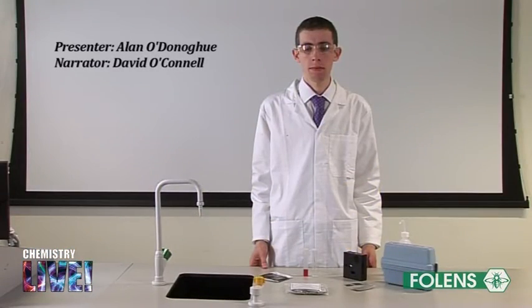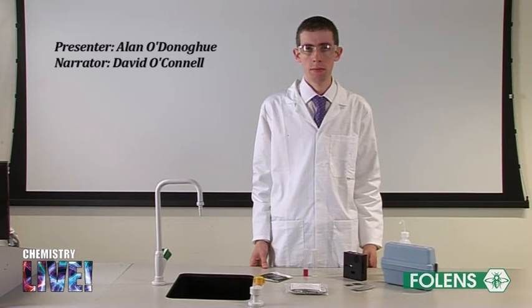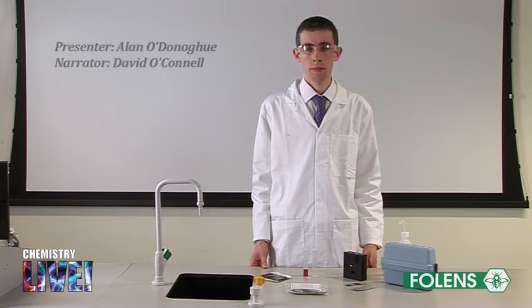Experiment. To estimate the concentration of free chlorine in swimming pool water or bleach using a comparator method.